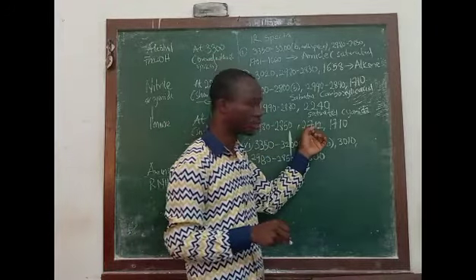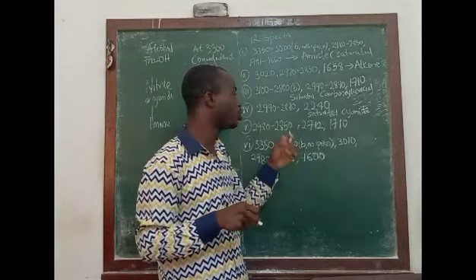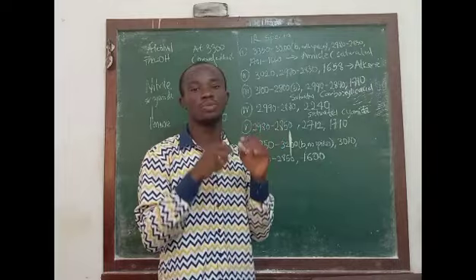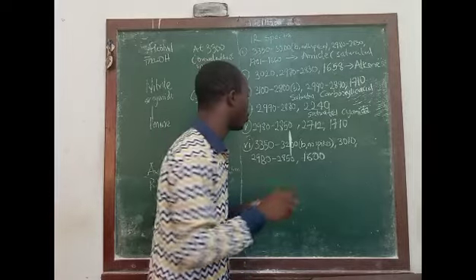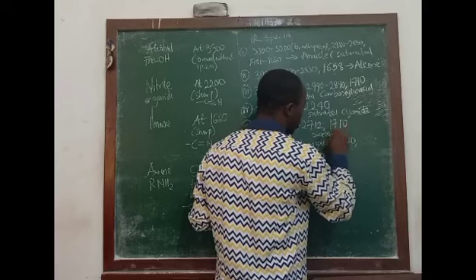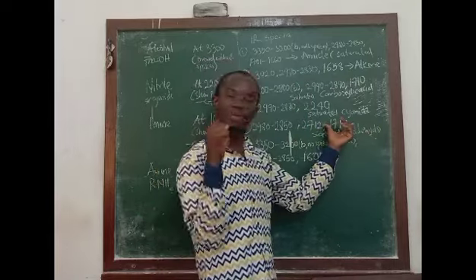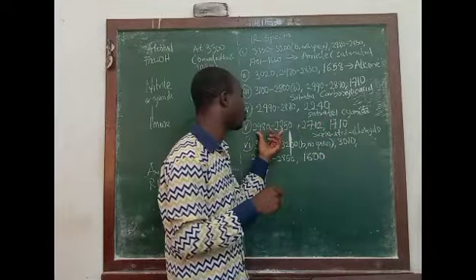With the signal here at 2712, we can conclude that this spectrum is for an aldehyde. At the same time, because we only have a signal just below 3000, it is a saturated aldehyde compound. So this one is a saturated aldehyde compound, because it has a carbonyl functional group, the diagnostic signal for aldehyde, and a signal just below 3000.